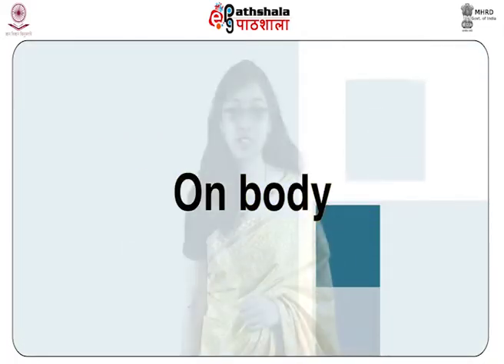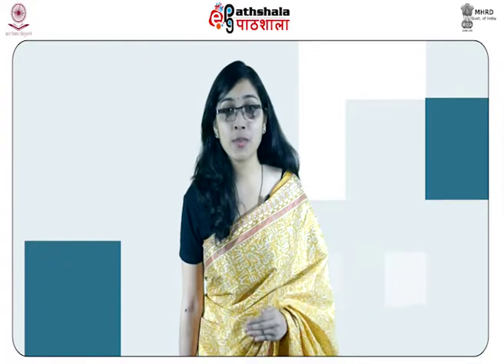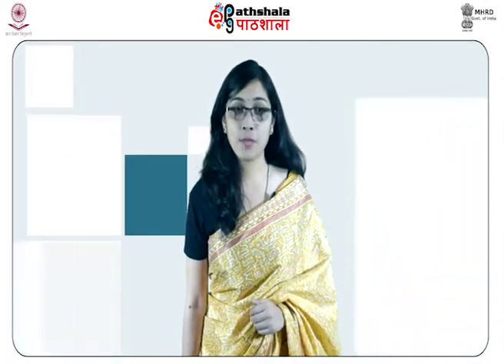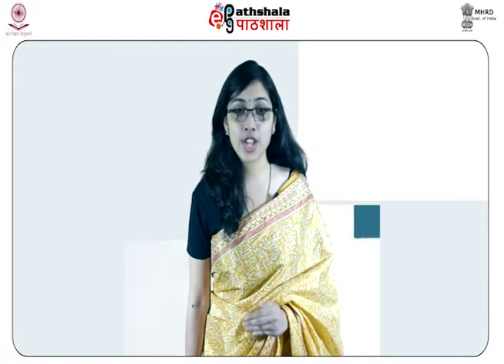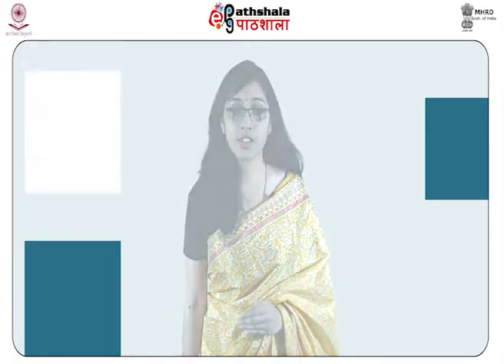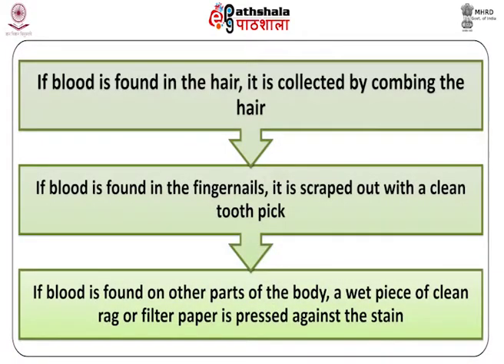When found on the body, the blood stains are sometimes found on the body of the culprit at the scene of crime. They should be carefully handled to avoid contamination from the body secretions. If it is found in the hair, it is collected by combing the hair. If sufficient quantities are not obtained, the hair is cut and collected. If the blood is found in the fingernails, it is scraped out with a clean toothpick.